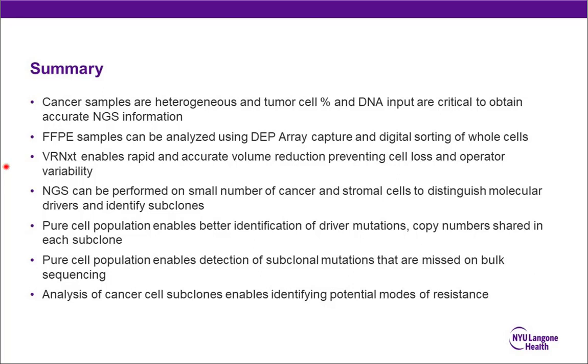You do preparation of, let's say, 4 samples at a time. You perform the deparaffinization, cell suspension, and staining at the same time. And then once everything is stained, the sample is good for at least a week. The staining will be good, so then you can do one run after another and collect them. You do suspension, deparaffinization and staining, and then run. If you time it well and organize the work well, it probably adds at minimum 3 days before you can put the samples on the chip.